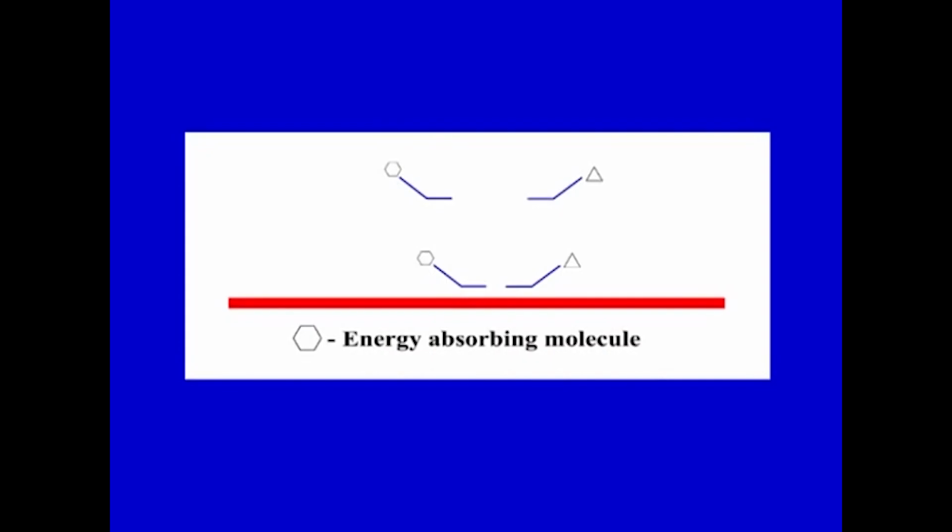Thus, measurement of the amount of fluorescence from the second tag provides a measure of the amount of the target DNA. So, when these two come together, that is, are brought into proximity, only then is the fluorescence measurement provided.